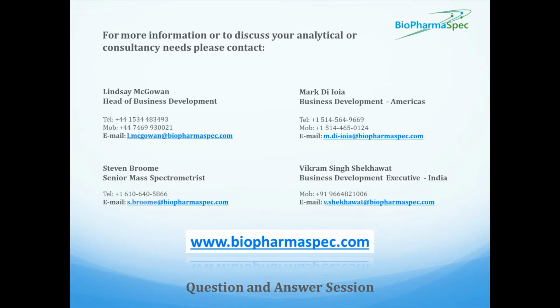All right, thank you. So it appears we're running a bit short on time, so this actually will be our last question. So if I needed to, could I use these residual analysis methods for batch release? Yes, you could do these impurity tests for batch release testing. With that being said, though, all the data and assays that I've discussed here today were carried out by BioPharmaSpec, and we're actually not a GMP or GLP certified lab, and batch release testing should be done by a GMP or GLP certified lab. However, what BioPharmaSpec can do is we can develop methods, right?